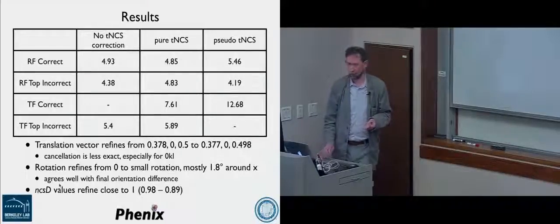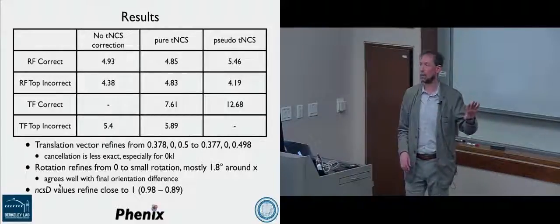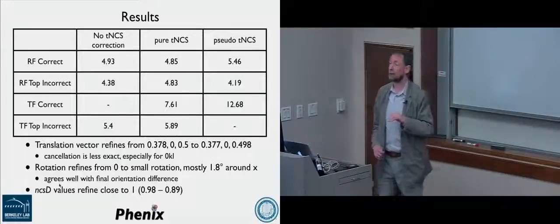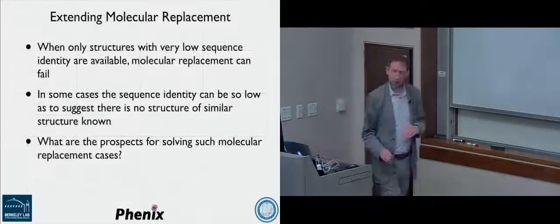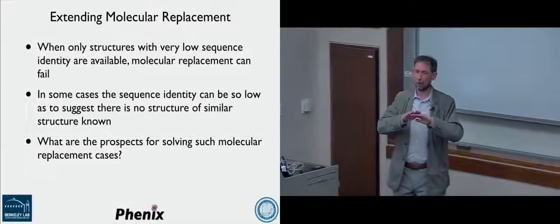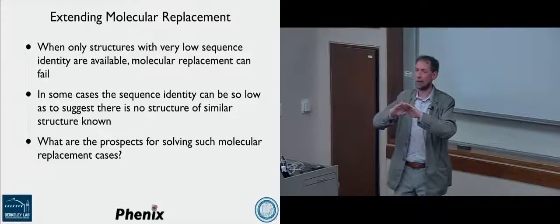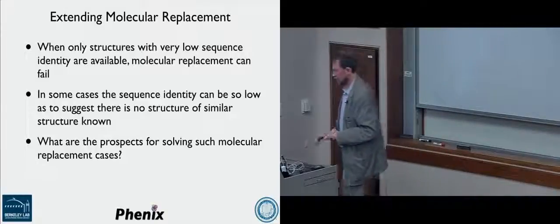So now you should be able to put in a case like this into molecular replacement, and it should work. So problems with translational NCS should be readily solved. And for those of you that have encountered it before, you probably appreciate that's kind of good and a big deal. What isn't done right now is to deal with a case where it's more than one translation vector. Sometimes you have unfortunate cases where you have multiple translational relationships between molecules, and that's more complicated.